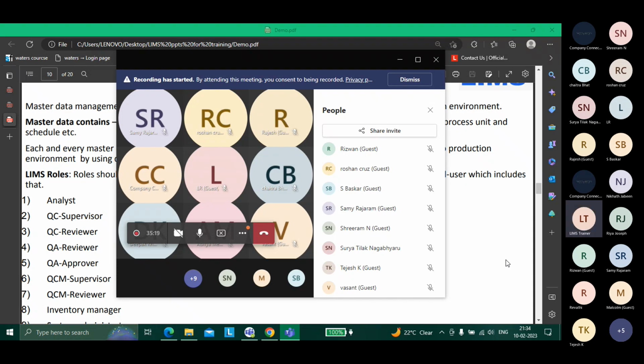He may be able to review some tests, and supervisor 2 may be able to review all the tests, including those of supervisor 1. Some people will have access to do something, and some other people will be able to do those things along with some more. Some others will be able to do those things but not some other things.